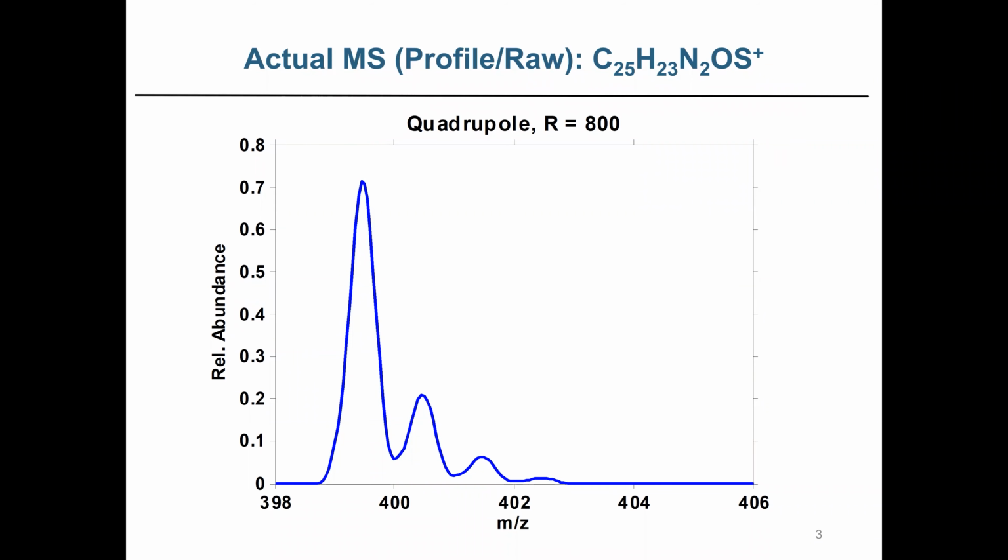And what happens is once the mass spectrometer scans this data, acquires this profile mode data, which by the way is also sometimes known as raw data or continuum data, it actually does the centroiding process, and we'll get into a little bit more detail about that. It pretty much picks the peaks for you and just displays it as centroid mode data. And that's pretty much what we're used to as mass spectrometrists. Some of that is historical because the centroid data is obviously highly compressed data. But unfortunately, when you do that, as we'll see, you're throwing a lot of information away that we can take advantage of.